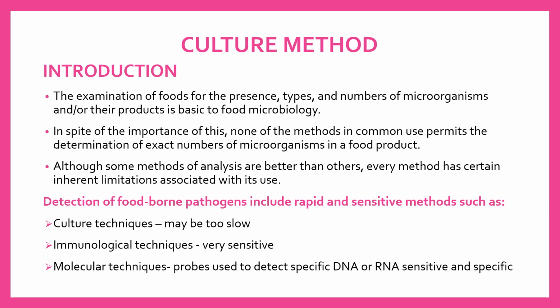Introduction. The examination of foods for the presence, types and number of microorganisms or their products is basic to food microbiology. In spite of the importance of this, none of the methods in common use permits the determination of the exact number of microorganisms in a food product. Although some methods of analysis are better than others, every method has certain inherent limitations associated with its use.